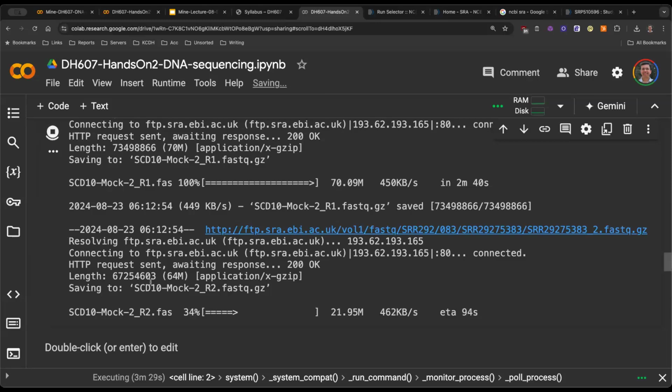But when you take this fragment, when you do the sequencing, you will only get part of it. So this will be 150, let's say. This from this side is 150, and the remaining is not getting sequenced because it's much, much longer.